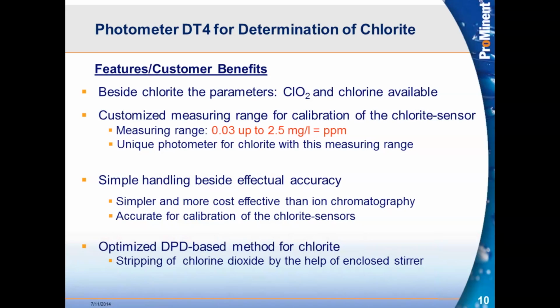So it's very important to know about what can cause problems with that, educate the customer, and let them know the benefits. On this DT4, this could be very good for one of the DACs that has a chlorine dioxide sensor and a chlorite sensor. You can calibrate both of those with the DT4. So it's a very beneficial way to package that all together going out to customers.